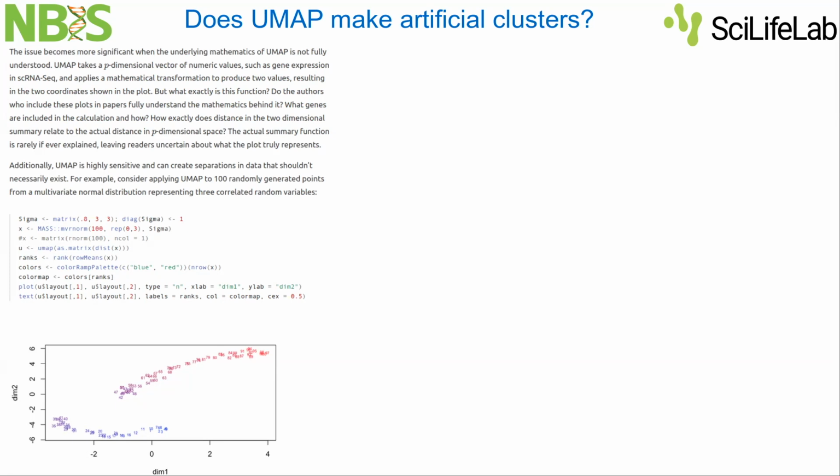So they all need validation. Any statistical model needs validation, including UMAP. If it suggests that there are these 1, 2, 3, 4 clusters, please validate them. It's just a suggestion. You can't expect UMAP to give you complete truth, but I tend to think about them as just a model that gives me some idea where to look further. Thank you. You're welcome.